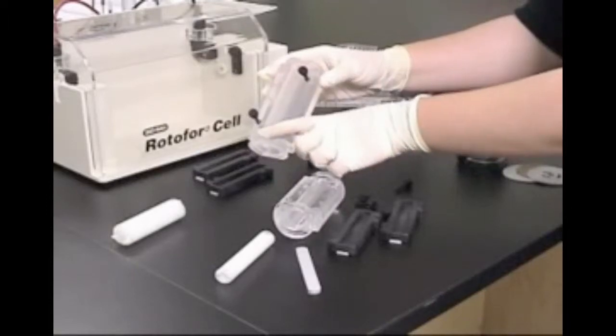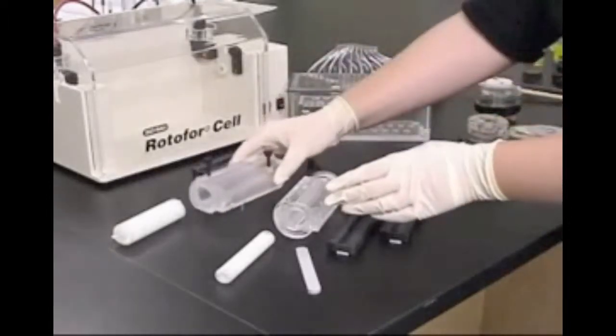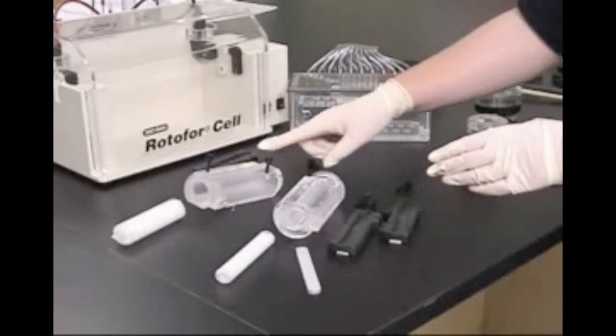Use the tape that is provided with the Rotofor to cover the harvesting ports. It is not necessary to cover the loading ports.